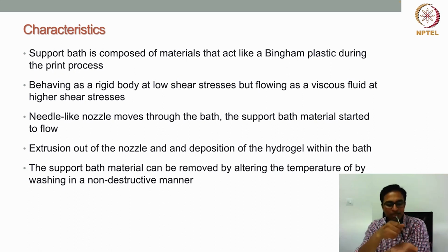Again, when the nozzle moves away, what will happen? The support bath material will come back to its original position and encapsulate the bioprinted structure, whatever shape or size, and again it will be like a solid structure. Because it is like a solid again, it can provide support to the deposited material. So that's what happens in the case of 3D printing in a support bath.